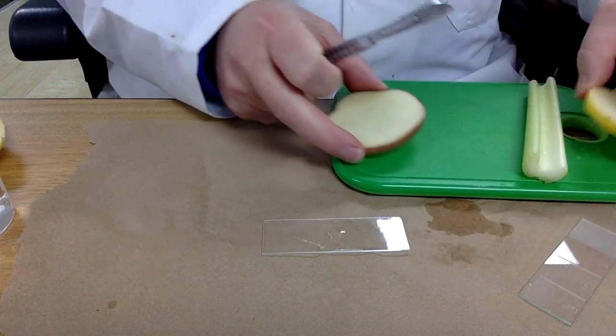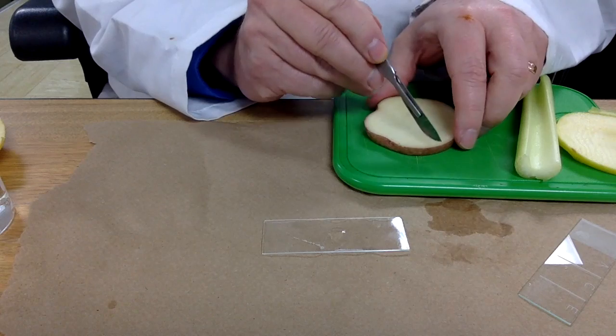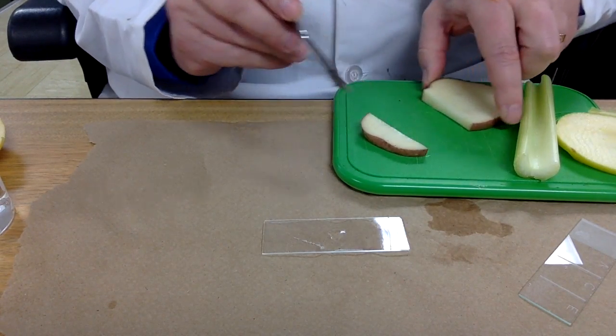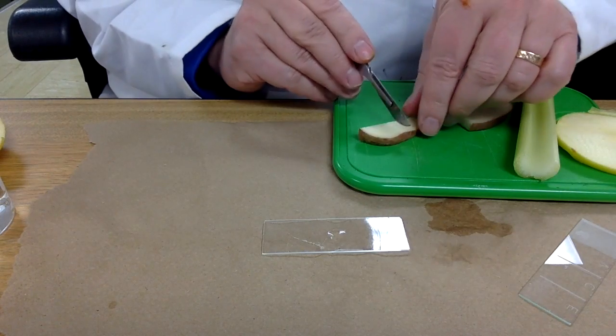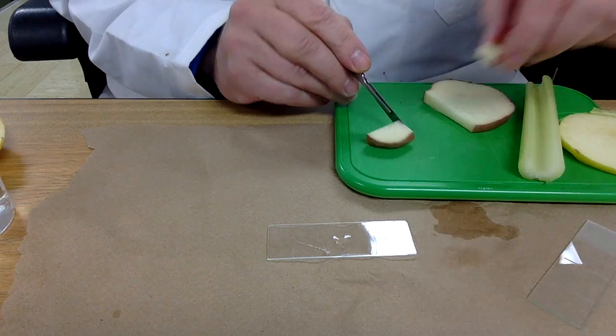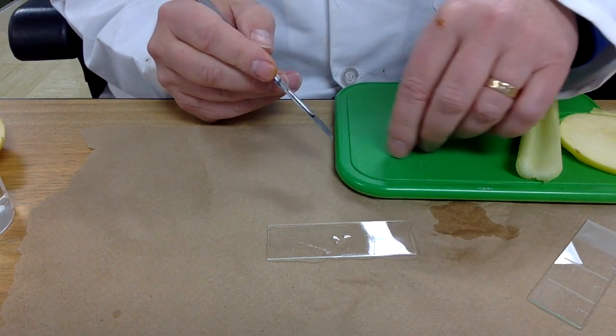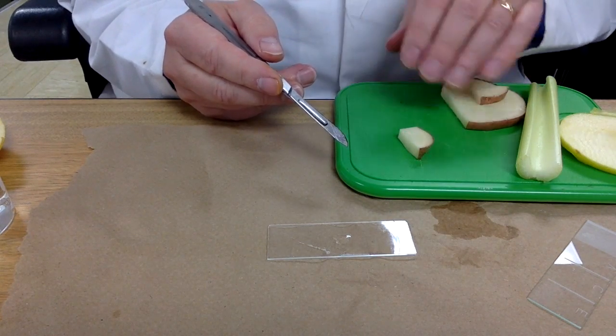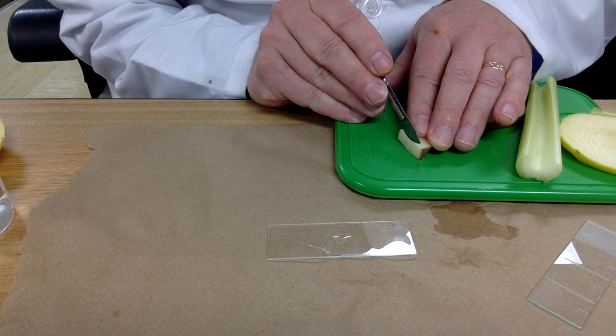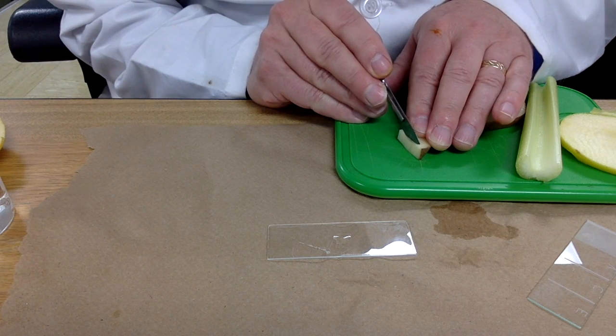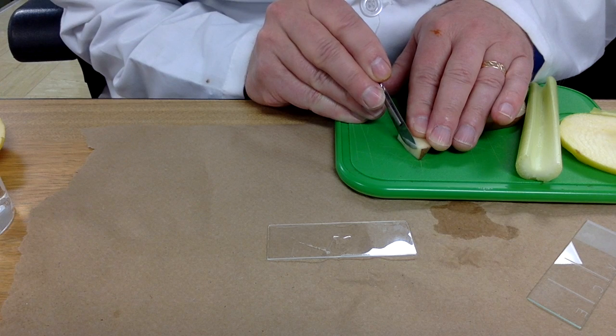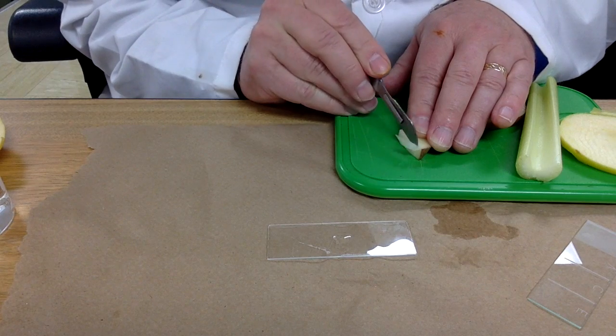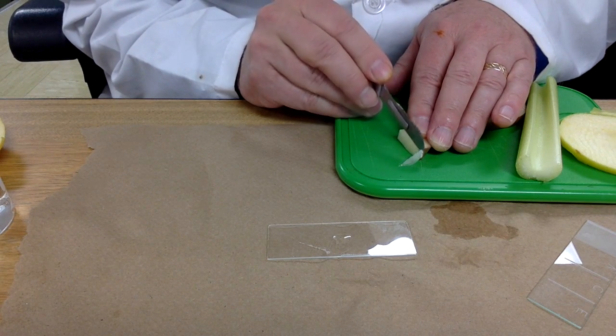To sample a potato, one will take a scalpel and slice the potato so you have something you can work with. Most young biologists tend to over-imagine what they need on their cover slip. You're going to try to cut an extremely thin slice and you'll use your scalpel to transfer that slim slice.